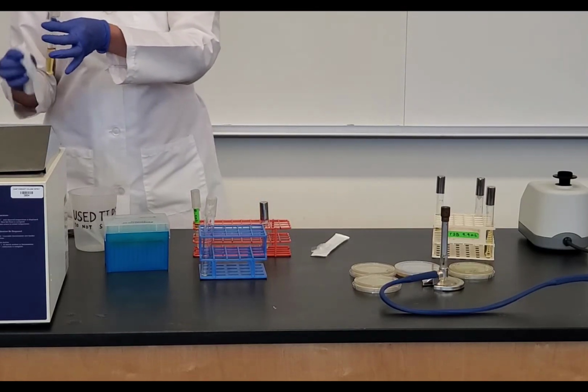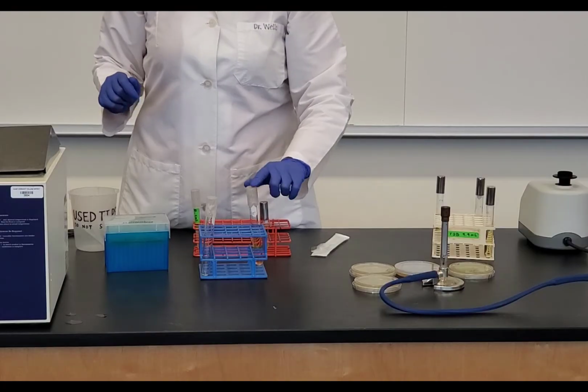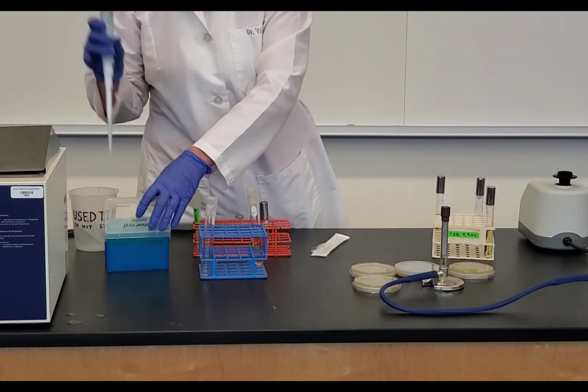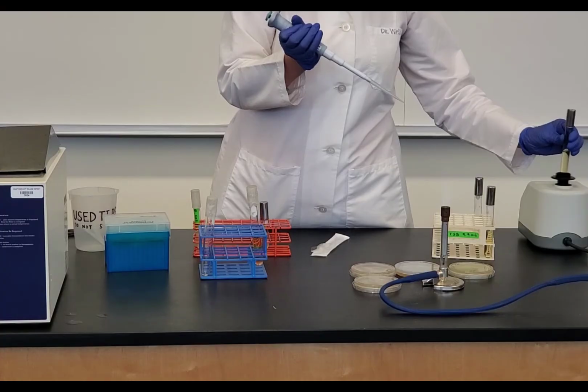I'm going to wipe off the extra water from the water bath. So there I have it. Again, I have to work quickly before that solidifies. So I'm going to get a tip. And again, I'm taking from my virus dilution. And I'll just go ahead and re-vortex again.